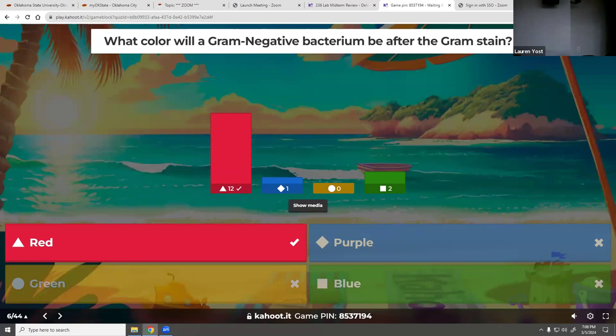You're looking at it, you're not sure of the color. You can ask, okay? If the question is whether the specimen that you see in the microscope is gram positive or gram negative, and you want to know, is this pink or purple? Because it looks so pink when I look at it, I can't tell if it's purple or not. Then I would just look at you probably, and I would say, it's red.